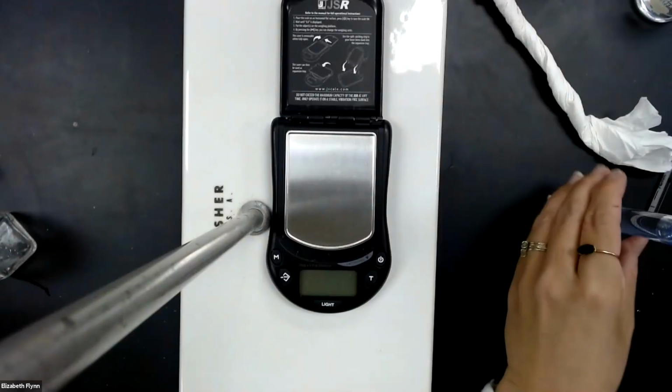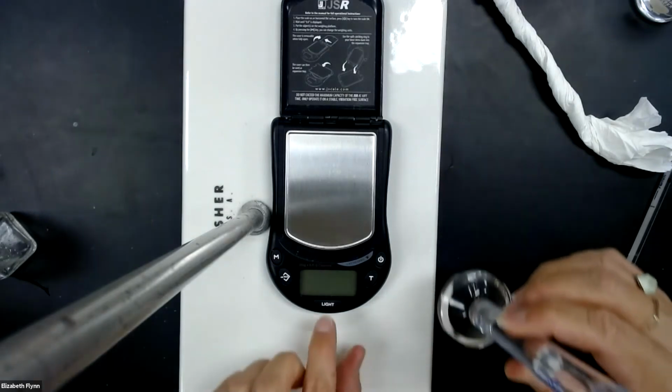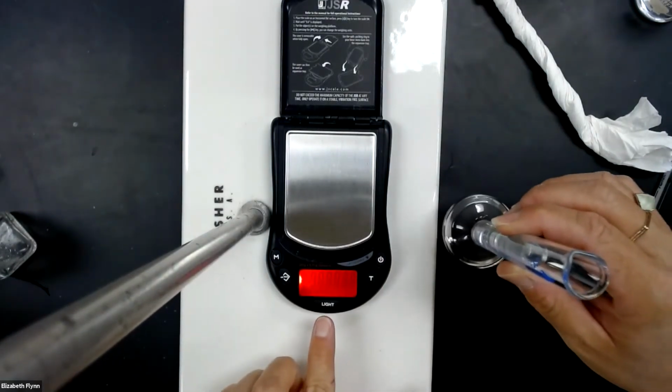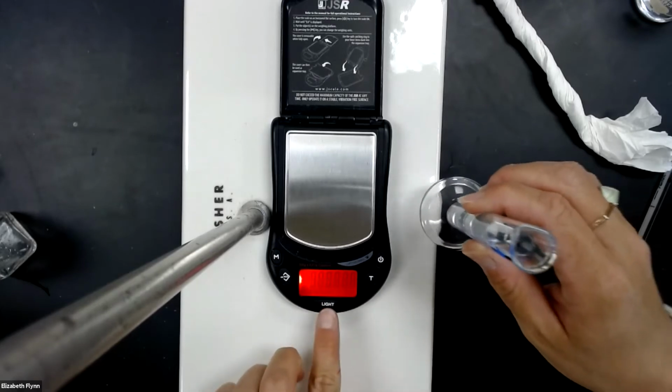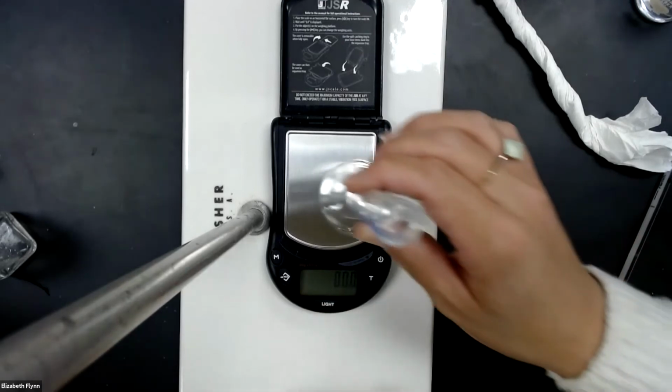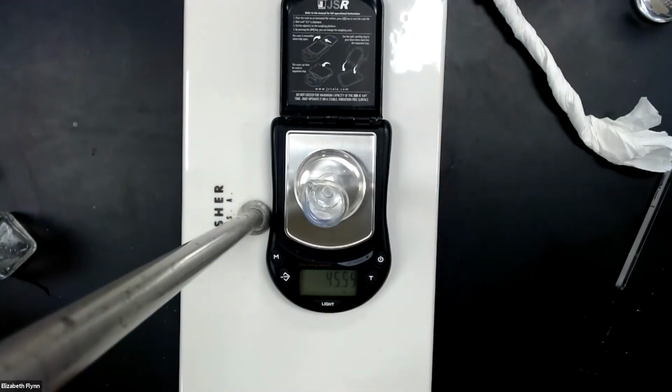And let's get the mass of the cylinder plus the saline solution. I'm going to turn off the light again, make sure that it's at 0, which it is. And now we've got a mass of 45.54 grams.